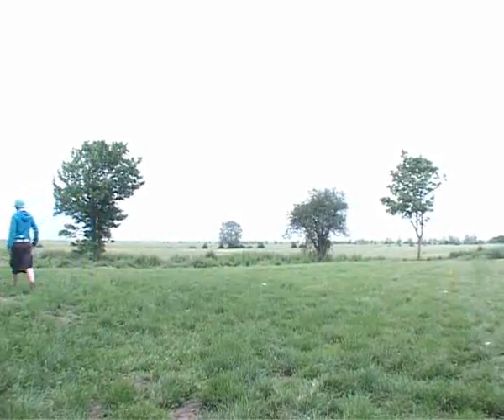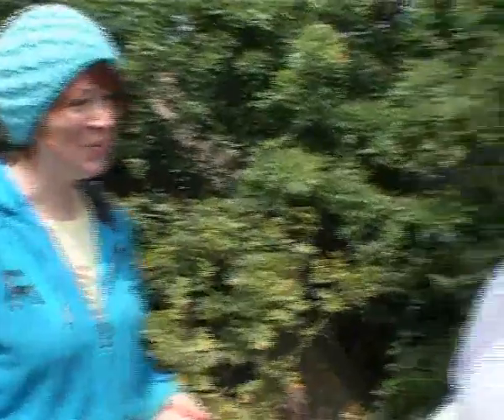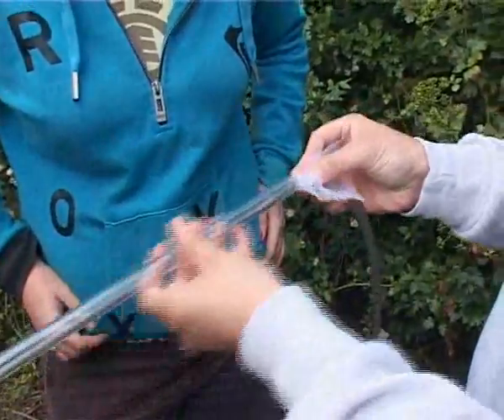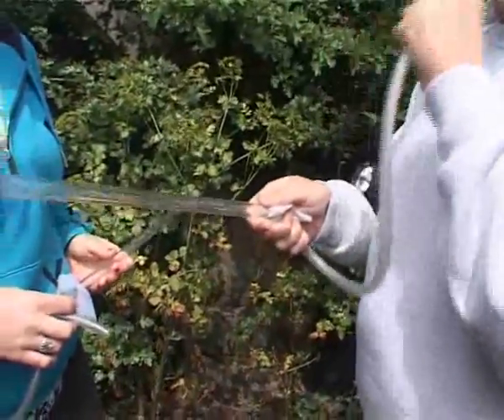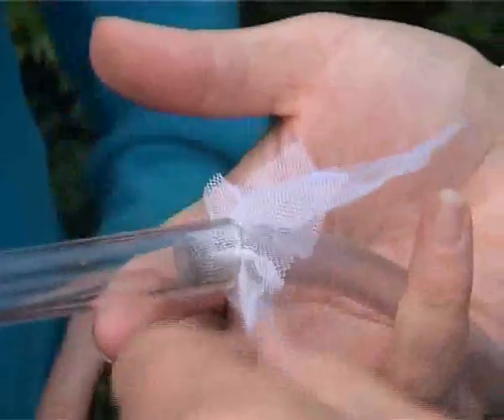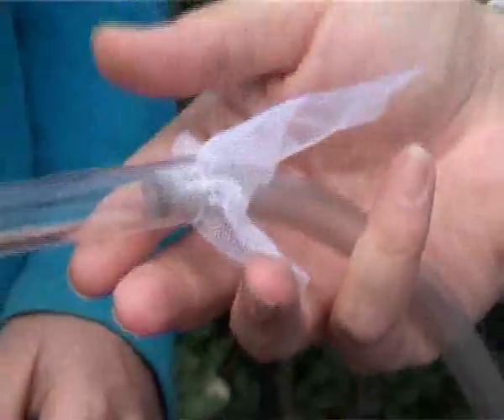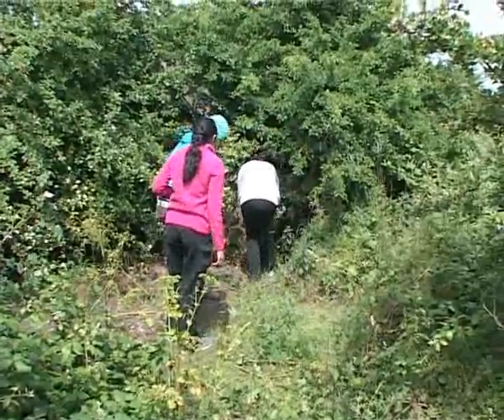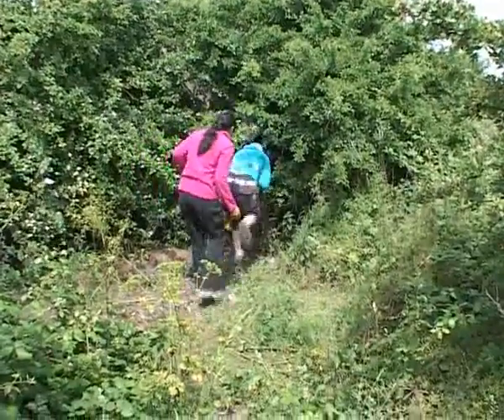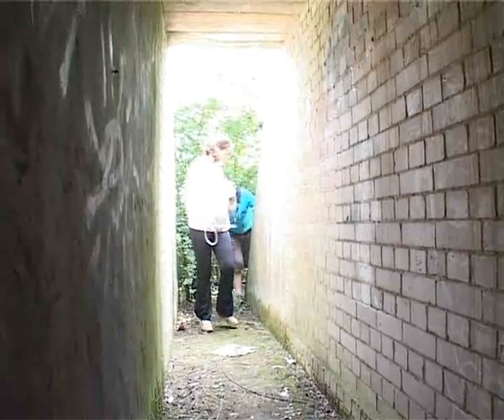So I'm actually going to have a go at collecting mosquitoes with you. What kind of things do I need to do? What are the tools of the trade? Well, basically we're quite simple here in the mosquito trade because this is a very simple aspirator. We call it a pooter, and all that it is is a glass tube so that you can see the mosquito, a rubber tube which is more flexible so that you can suck up the mosquito, and there's just one tiny piece of gauze in between which stops you breathing in the mosquito. This place behind us here is an ideal place — it's an old war bunker, a little bit overgrown, but we have to battle our way inside and there should be lots of lovely mosquitoes just waiting in there for us.